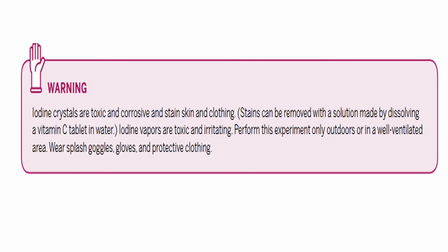Stains can be removed with a solution made by dissolving a vitamin C tablet in water. Iodine vapors are toxic, so don't inhale them. Though iodine vapors are toxic and irritating, perform this experiment only outdoors or in a well ventilated area. Always wear splash goggles, gloves and protective clothing. So these are the precautionary measures to be taken before doing our practicals.